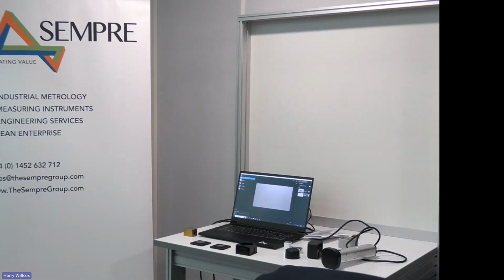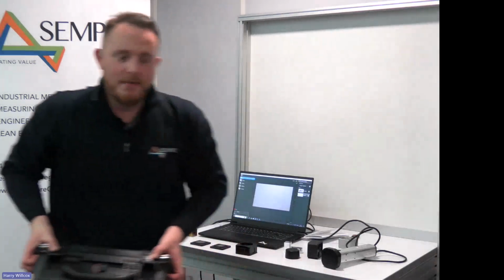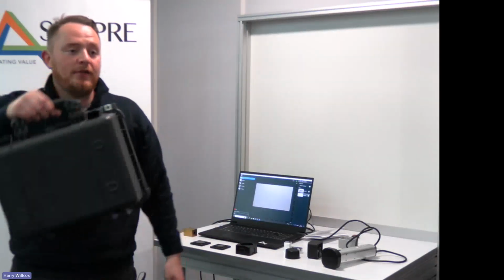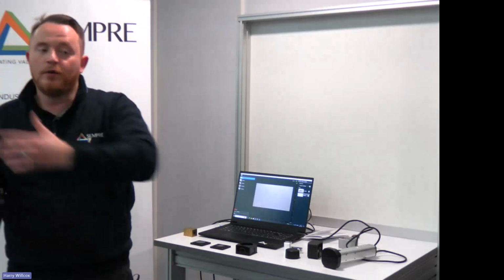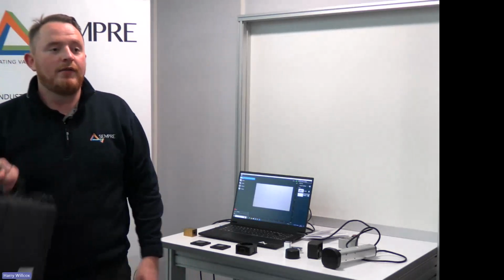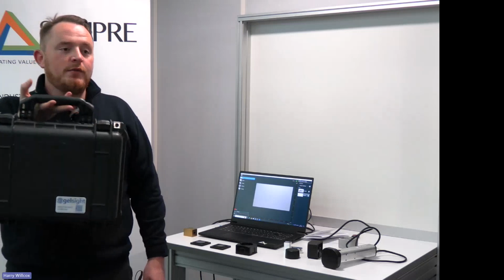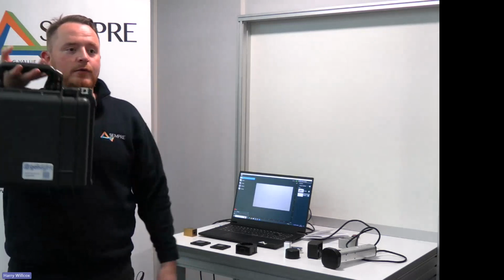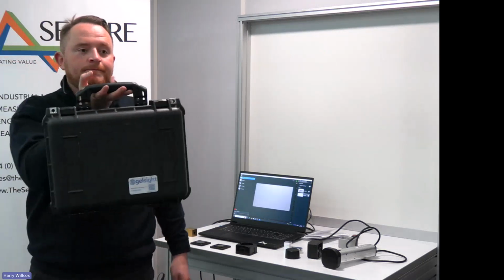So once we've done our scans and completed our measurement, I can pack all of the equipment back up into my box, either put it back in the calibration area, or go to the next cell or the next department to have a look at some samples. Everything you would need related to calibration, pads, cleaning, laptop is all kept within this little Pelican case. All right.